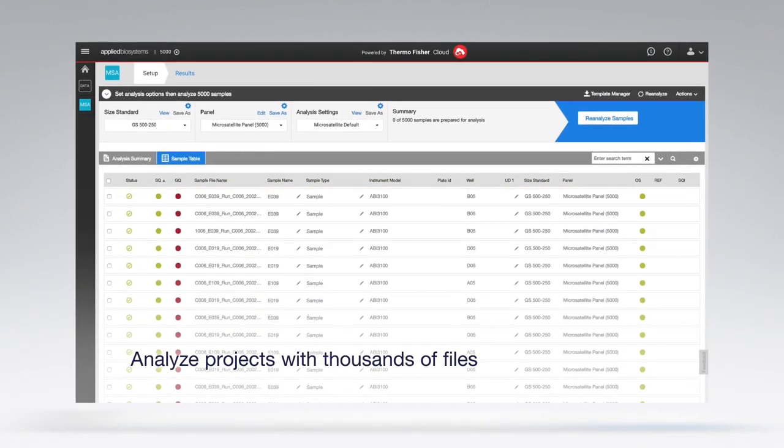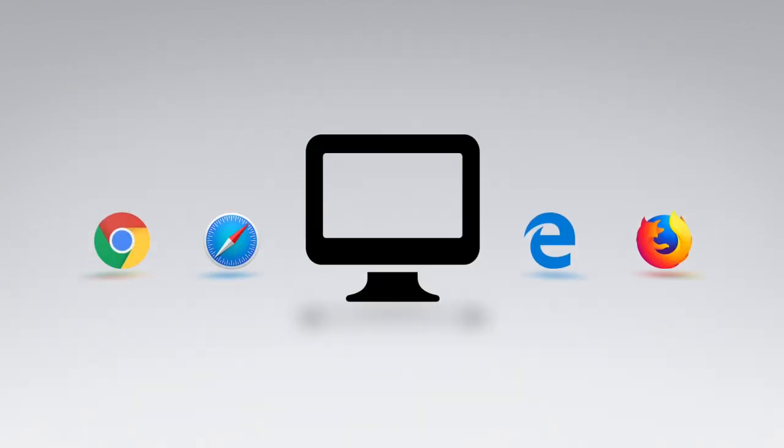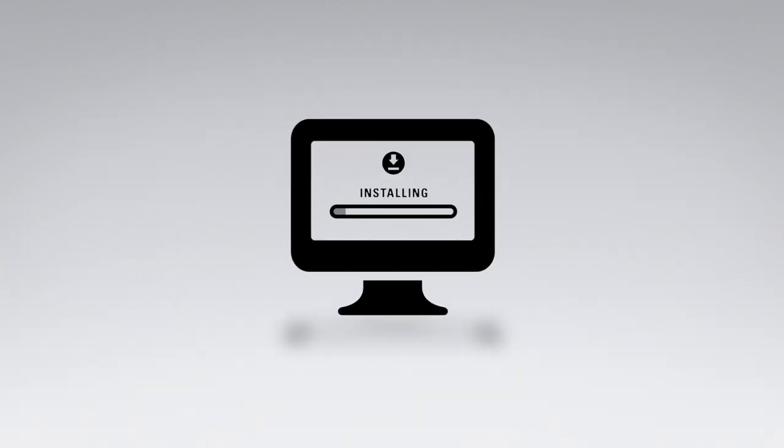This easy to use and intuitive software runs on any computer with a modern browser. There's no need to install software on your computer.